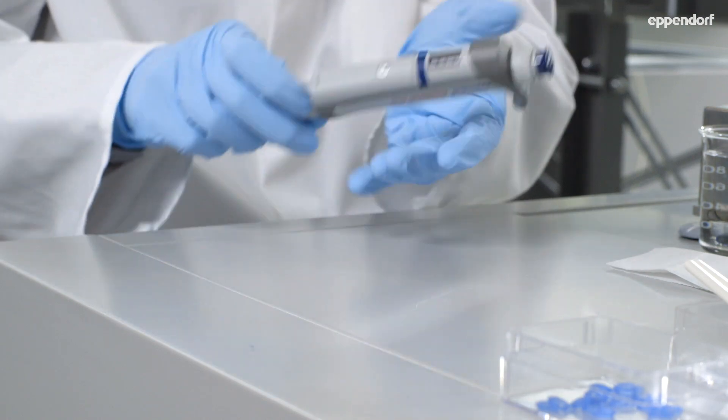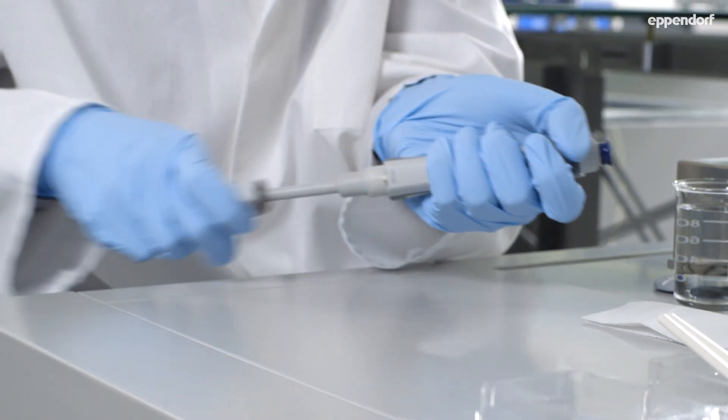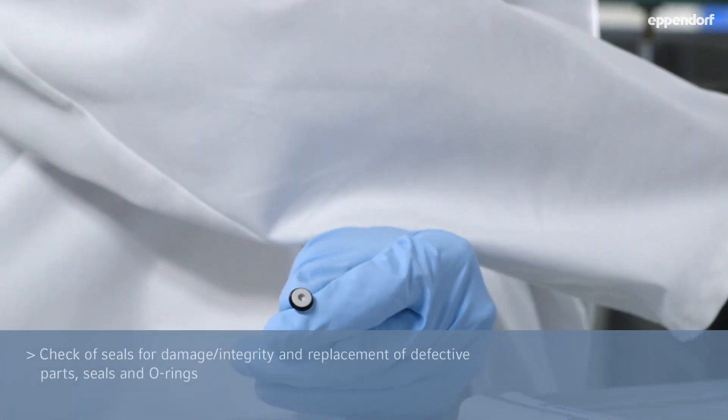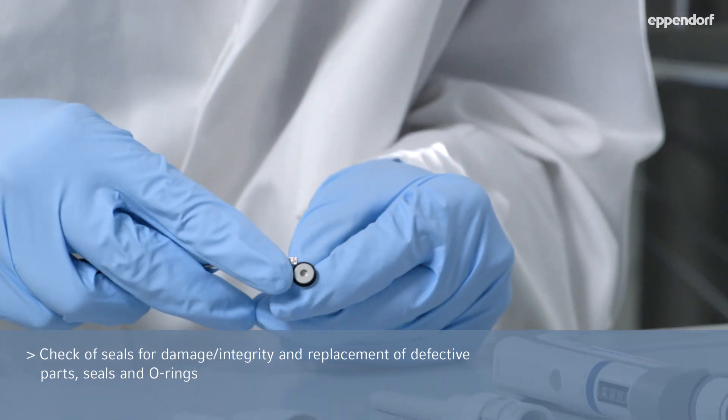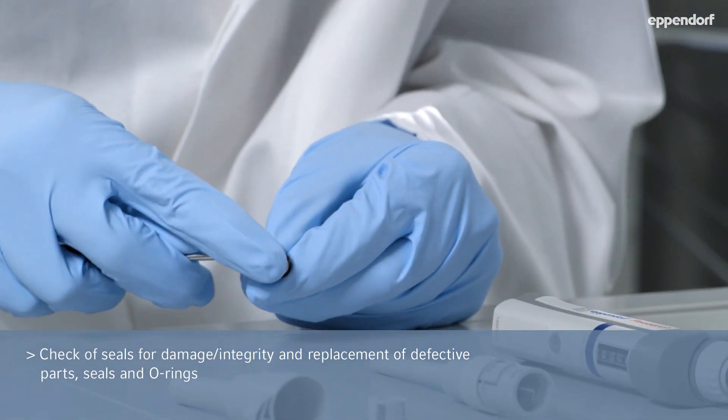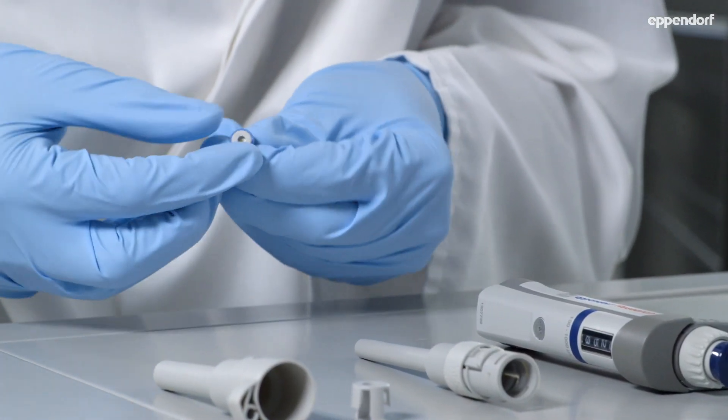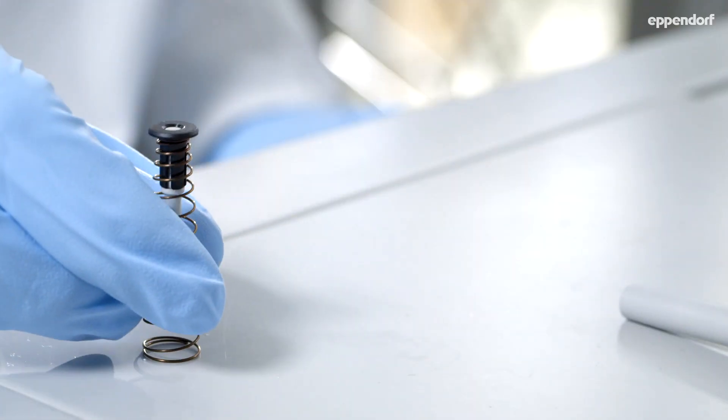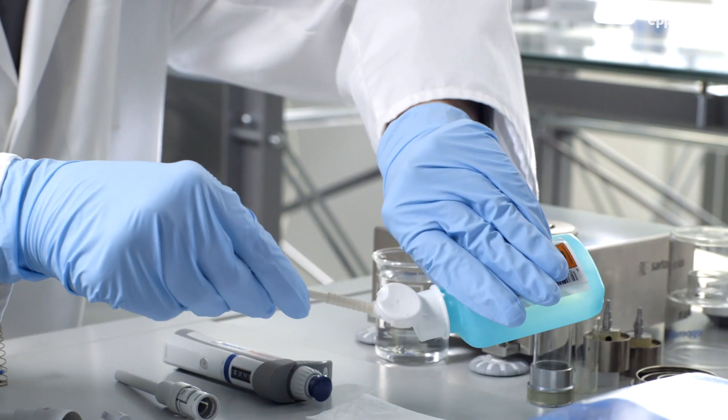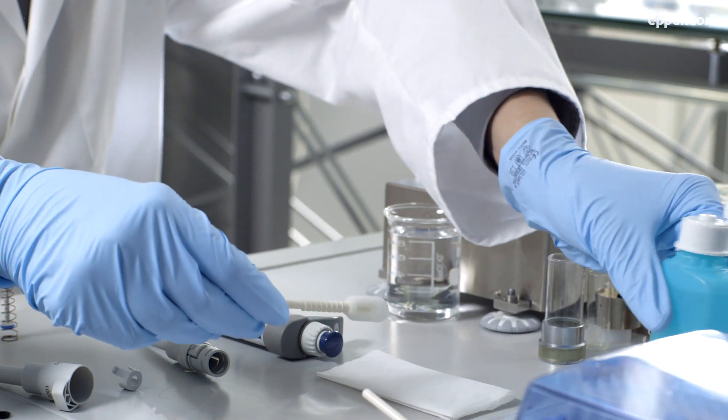We inspect pipettes from all manufacturers. For more information on routine maintenance and cleaning instructions in between professional services, please visit the user guides on our website.